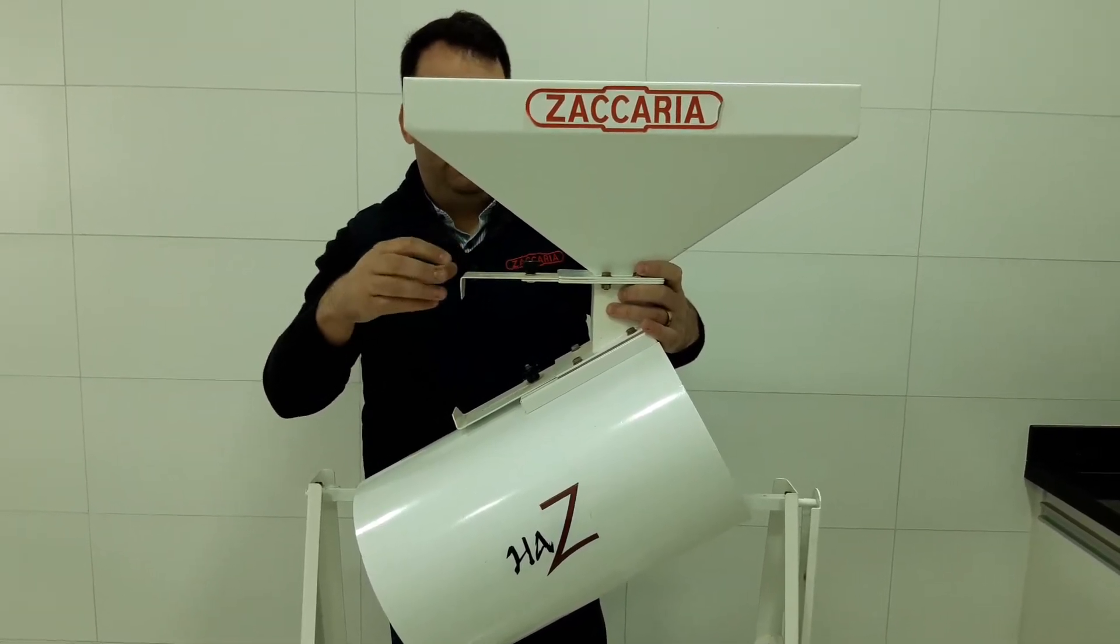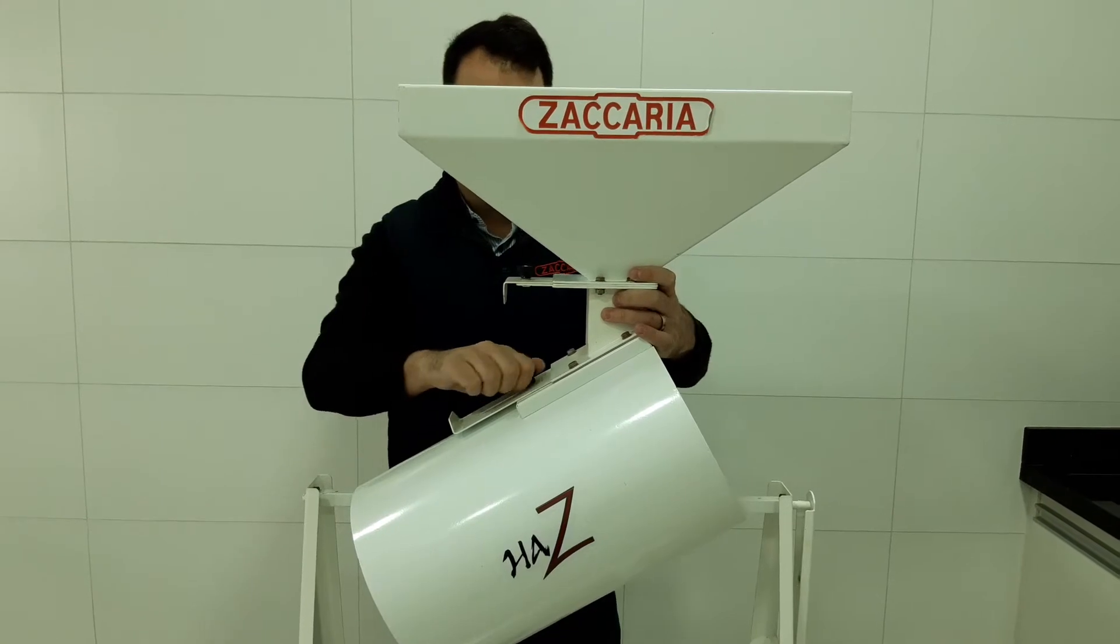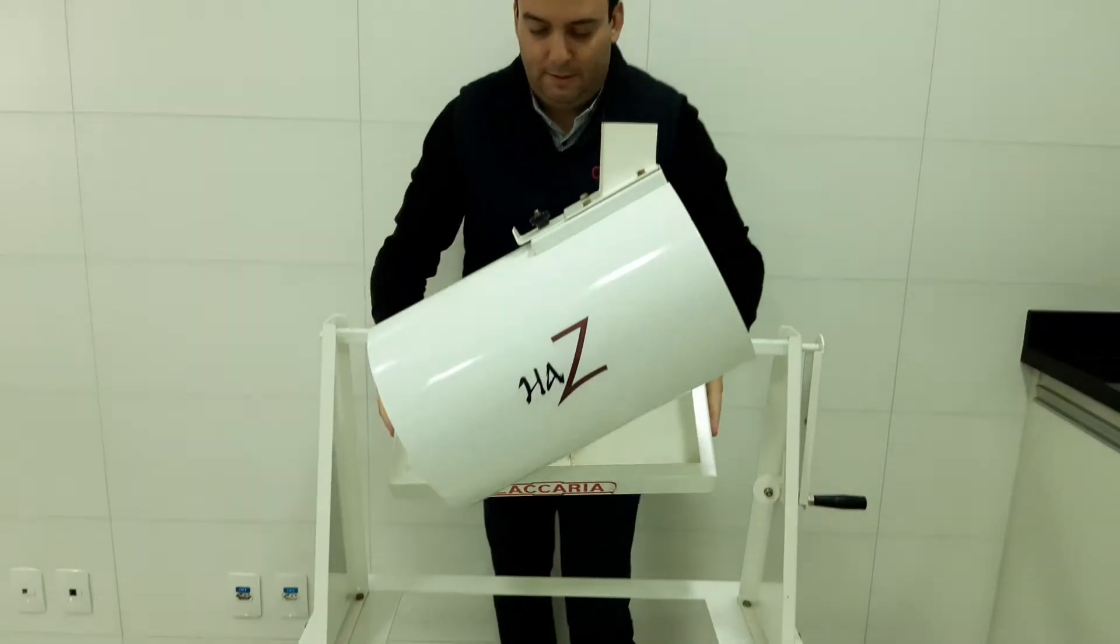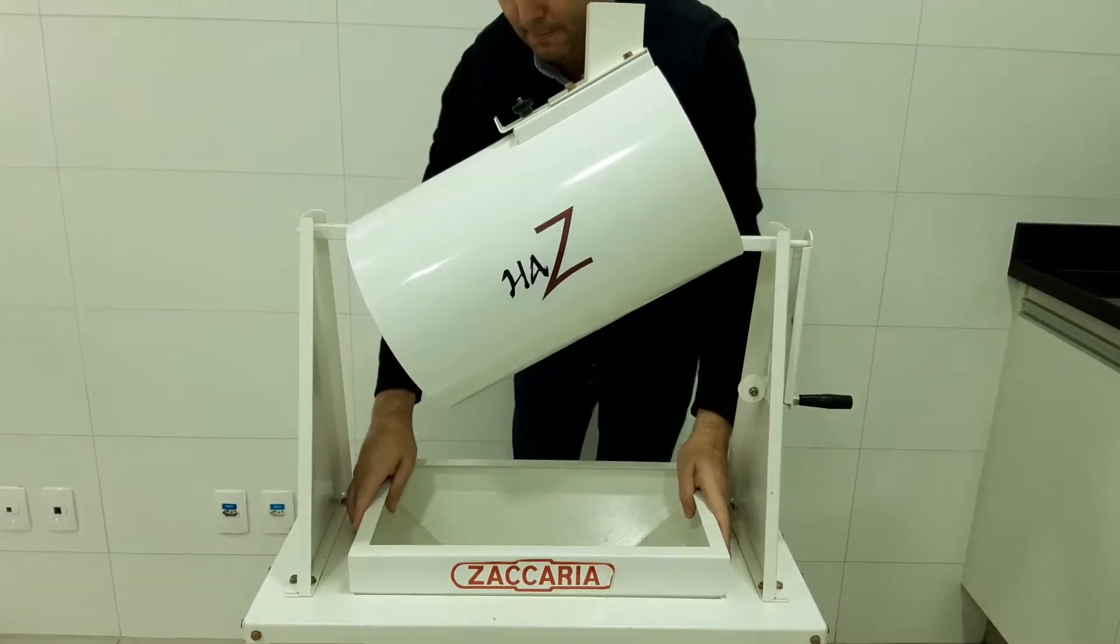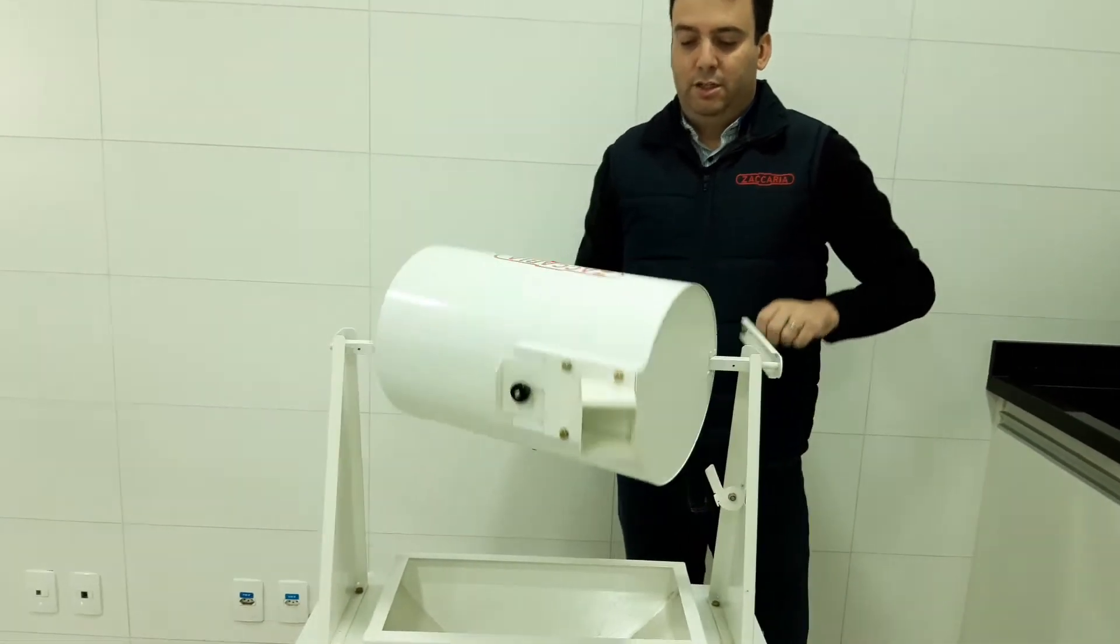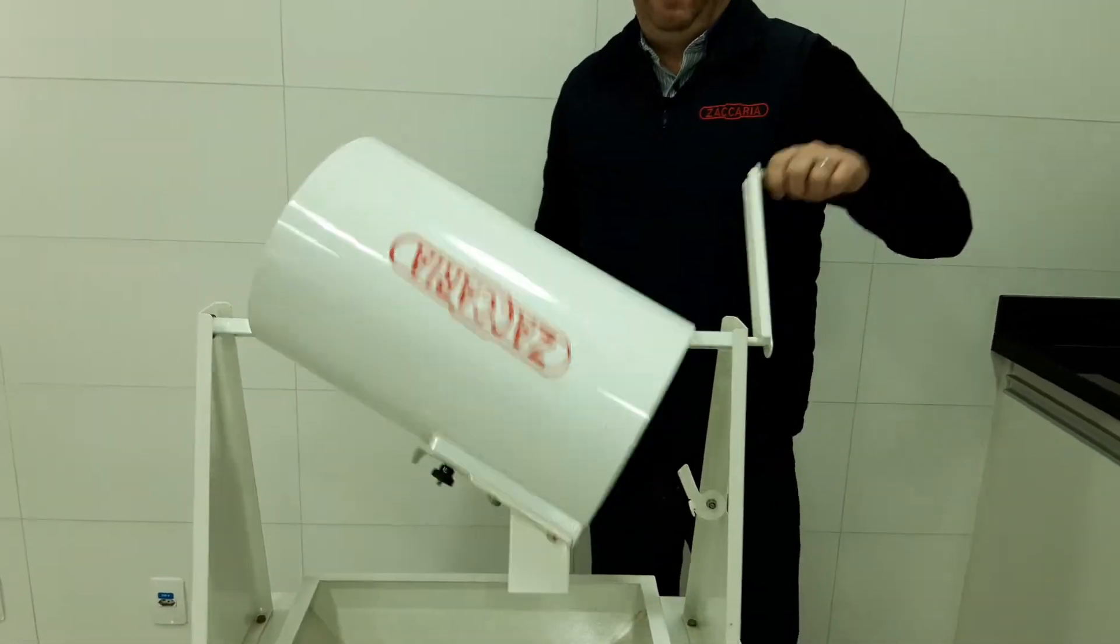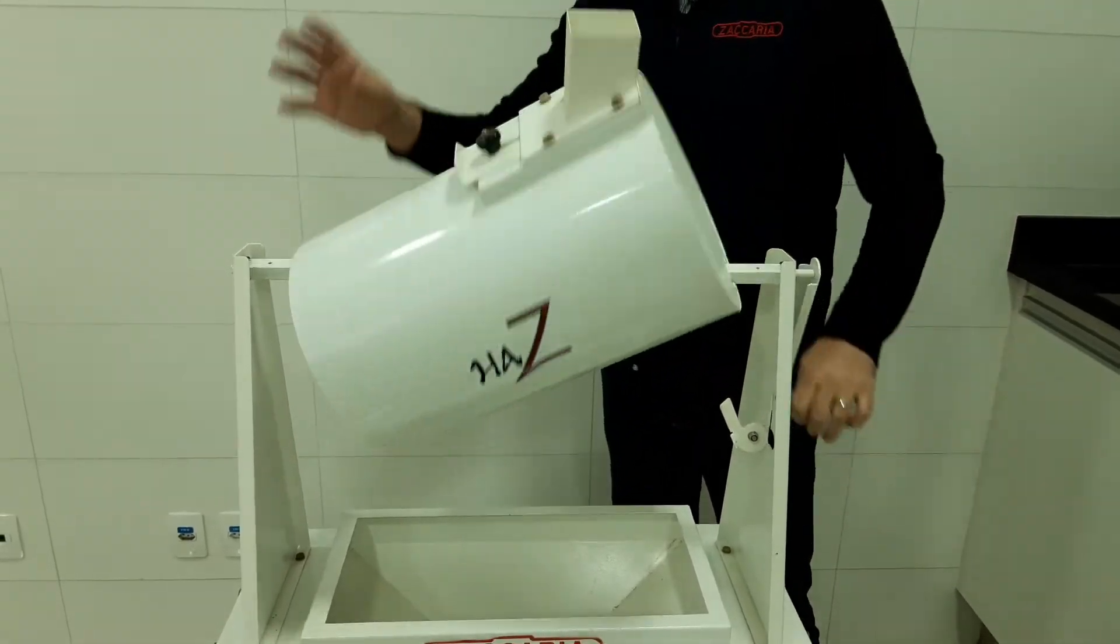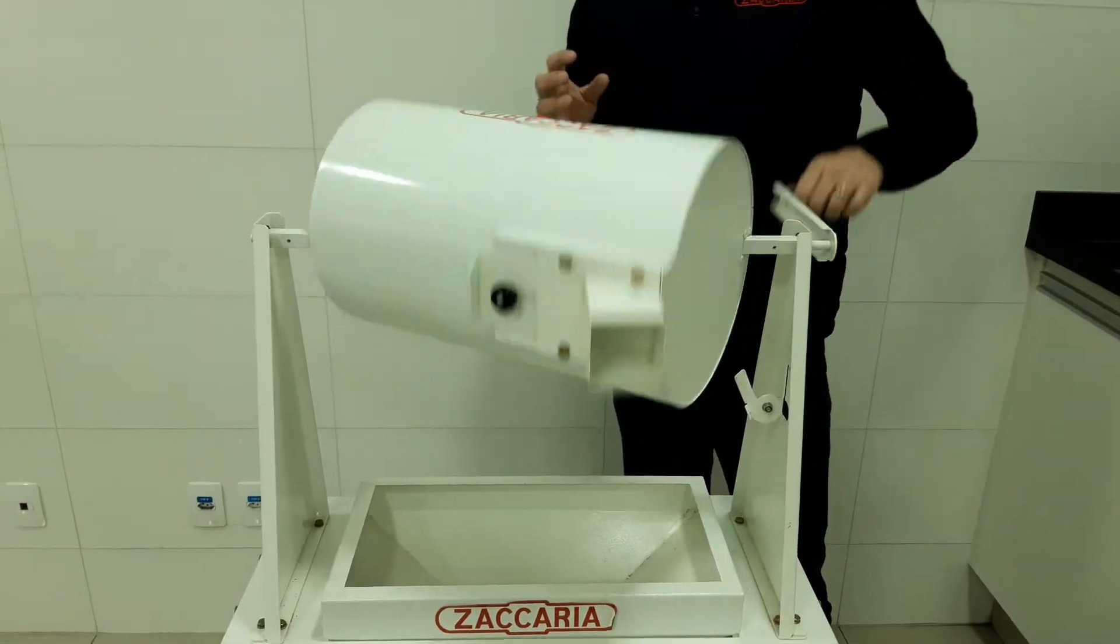And here is the inside equipment. And now we are going to turn it on to homogenize the paddy. Why do we do that? To make sure the paddy will be uniform.